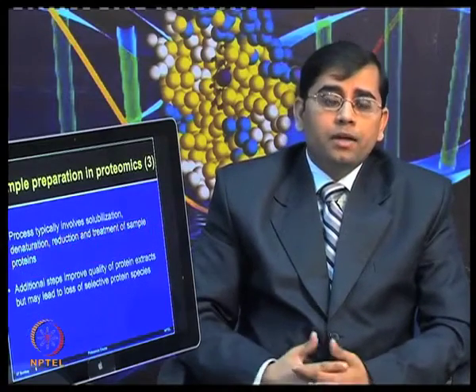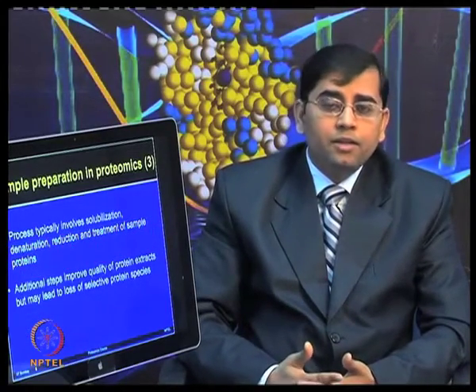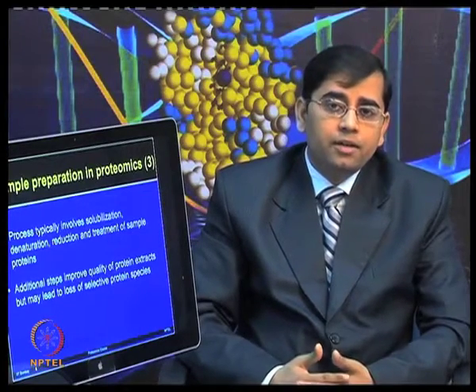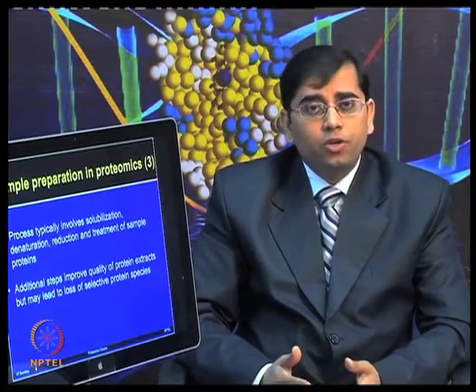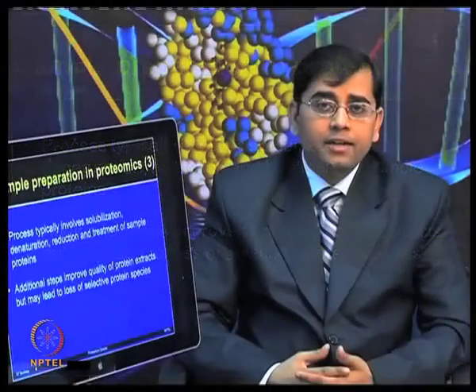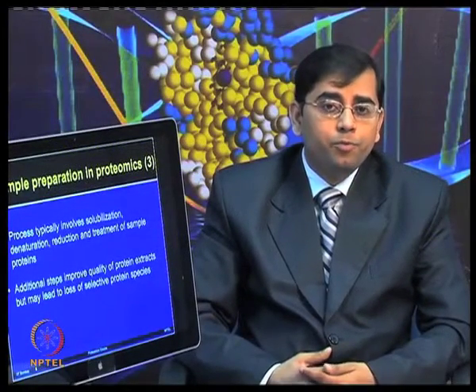Now, all of this sample processing involves solubilization, denaturation, reduction and treatment of sample proteins. But you need to include additional steps depending upon the type of samples and your objective, so that the protein quality, the protein extract, can be improved.